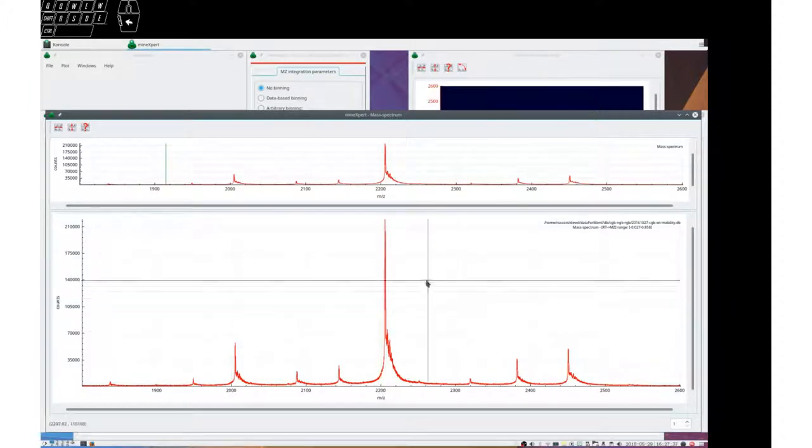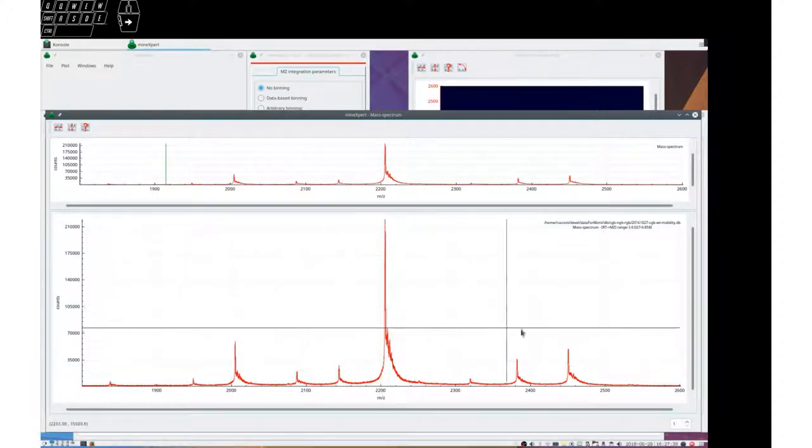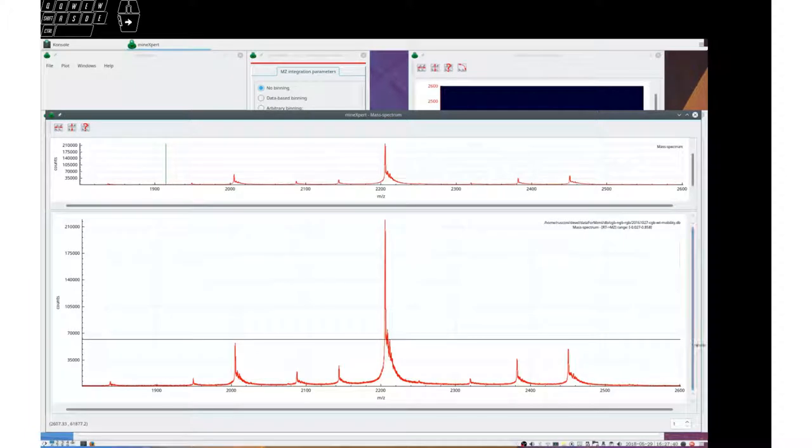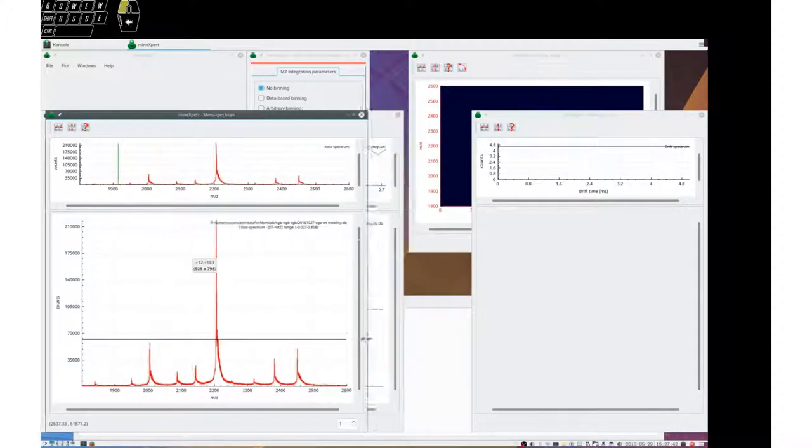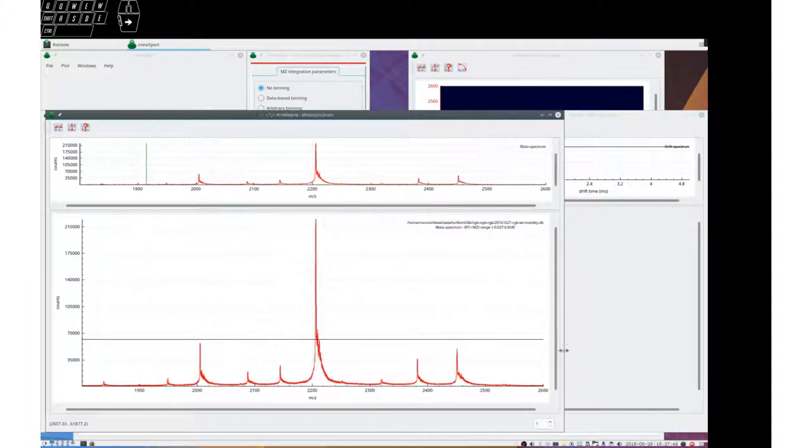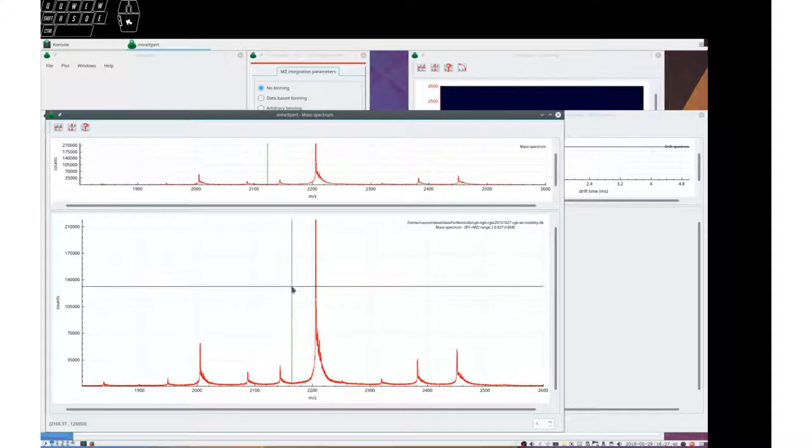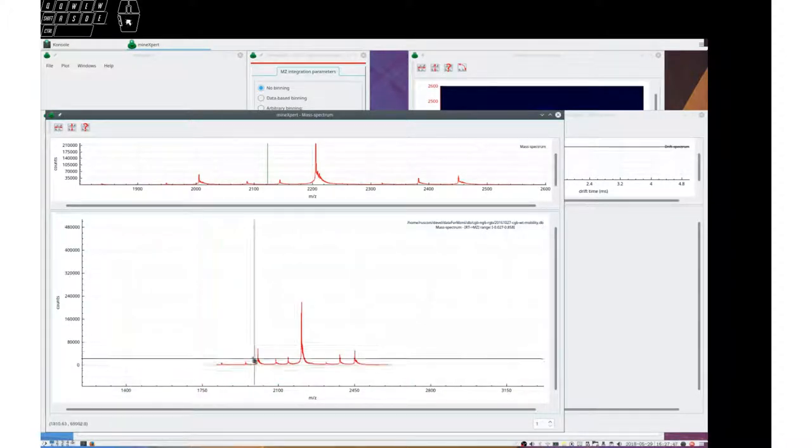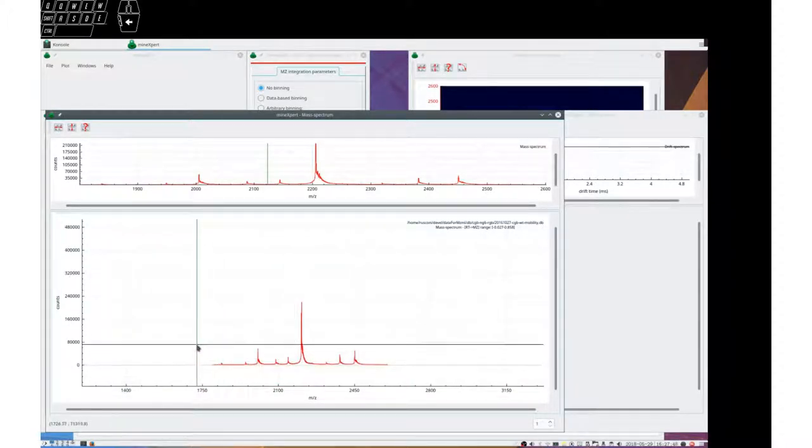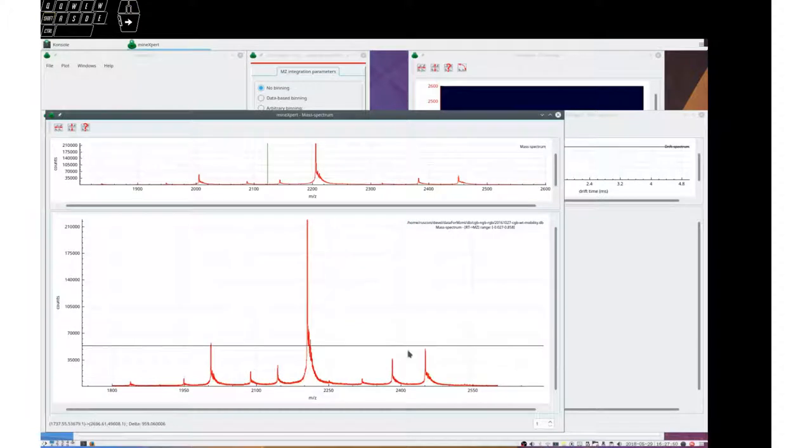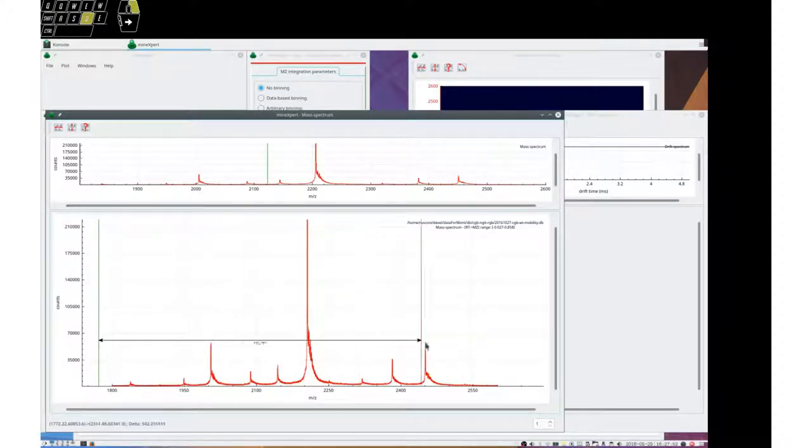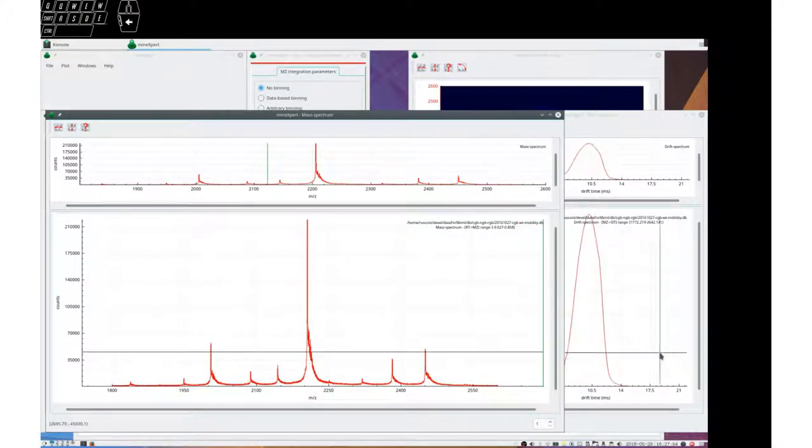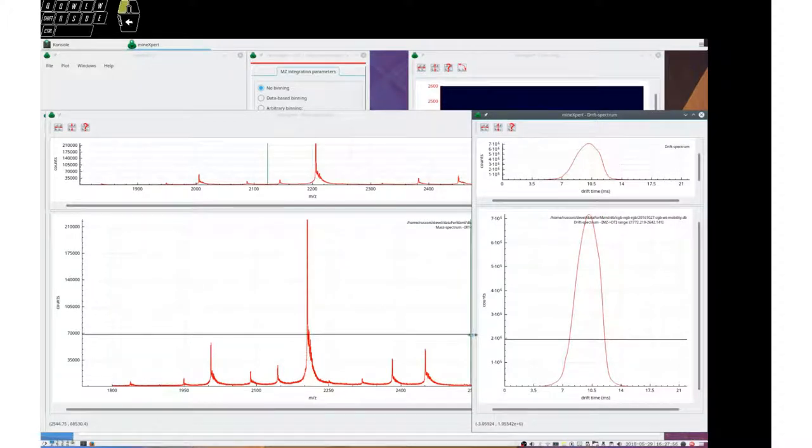Note that all these ways to move in and to navigate the data is totally identical in any of the widgets. For example, if I integrate this to a drift spectrum, we would see exactly the same logic.